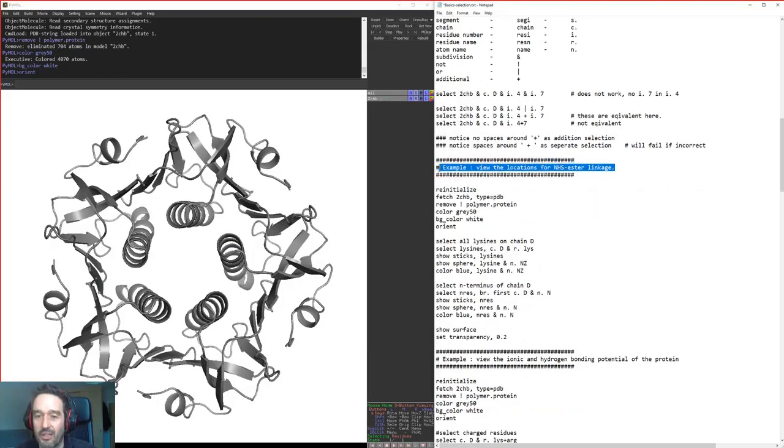Sorry, I should tell you this is an example. Your boss, whoever that might be, may even be yourself, is interested in looking at areas on a protein where we can do some kind of NHS ester modification. Therefore what we want to do is identify all of our primary amines, and this is a method to do that quite easily. So really we're looking at lysines and the N-terminus.